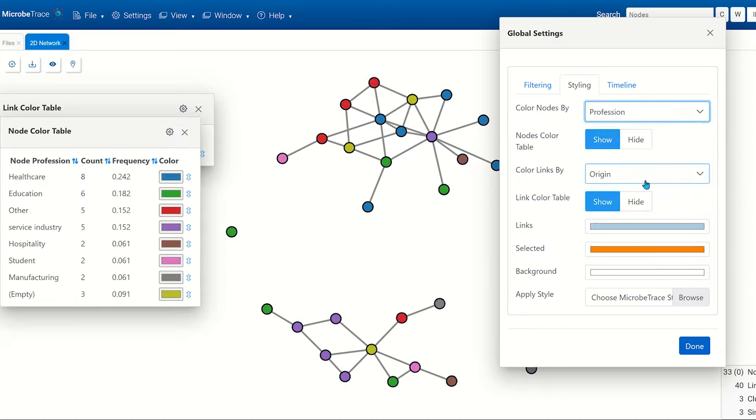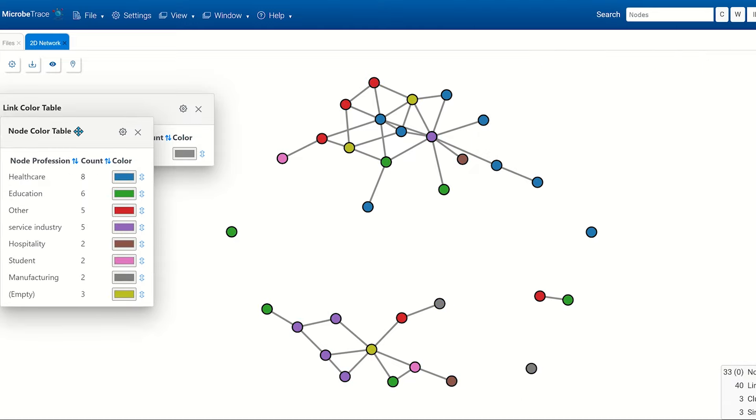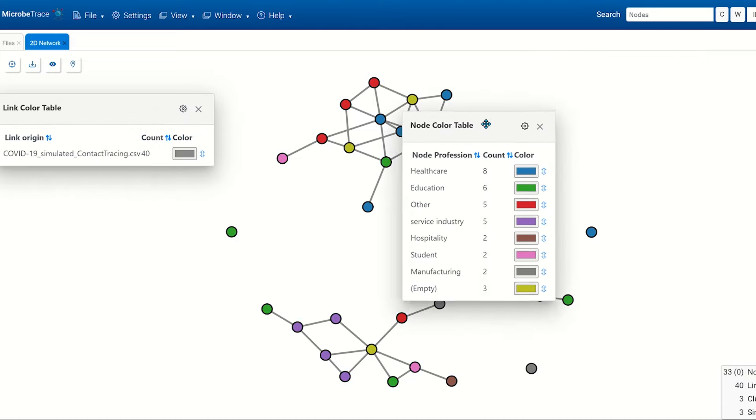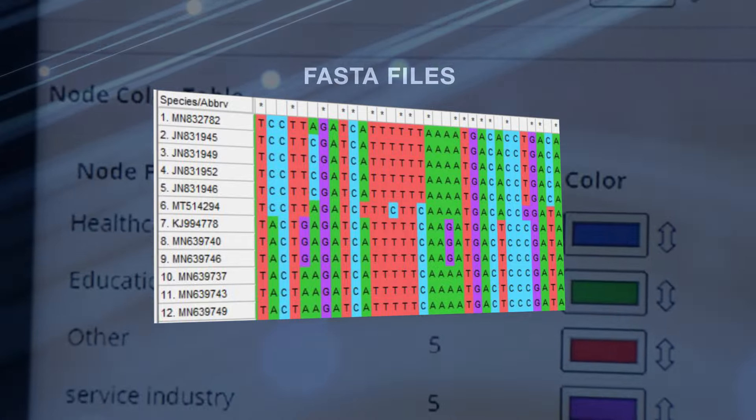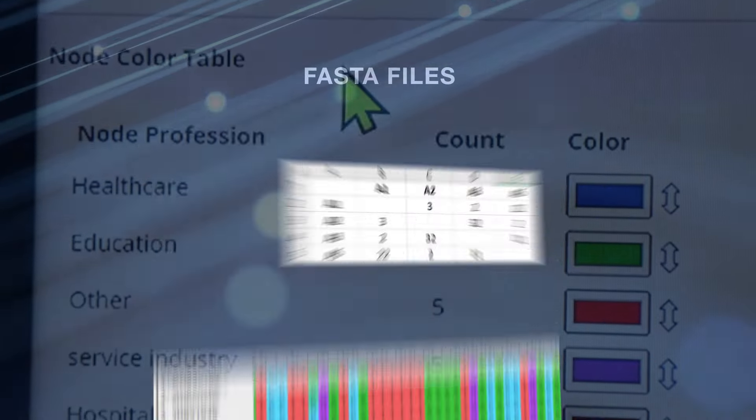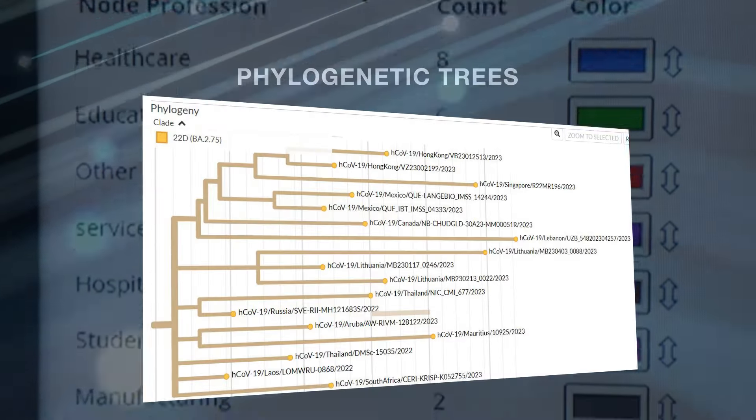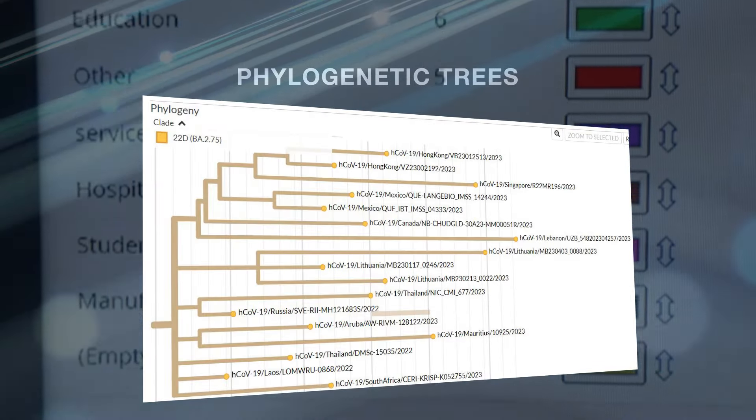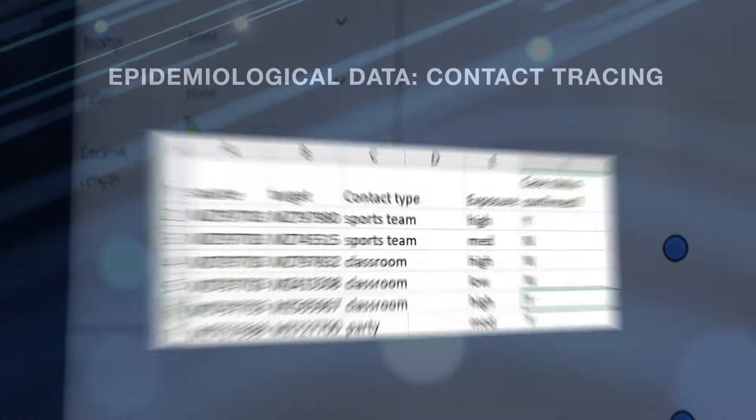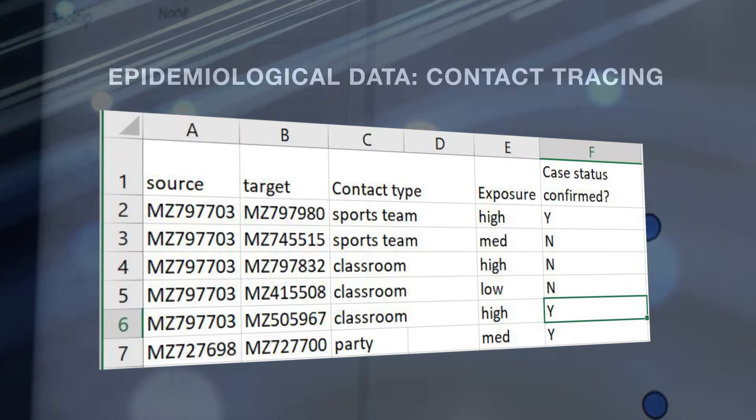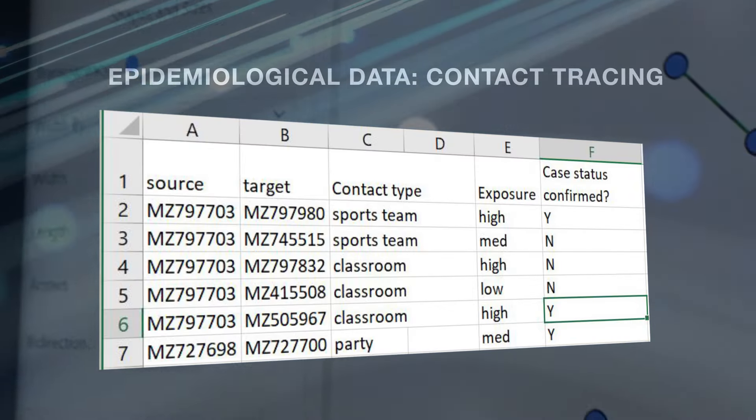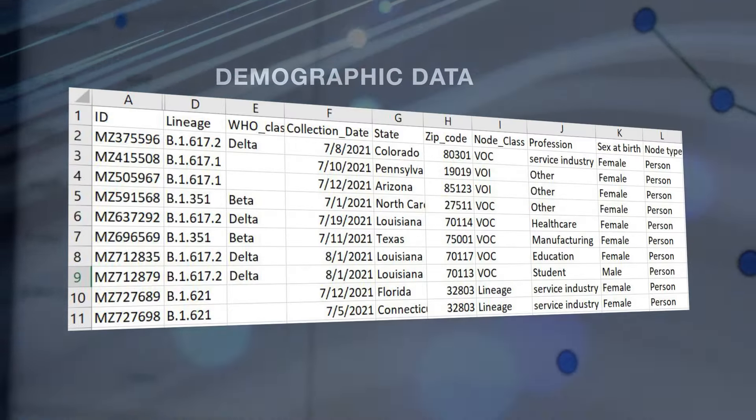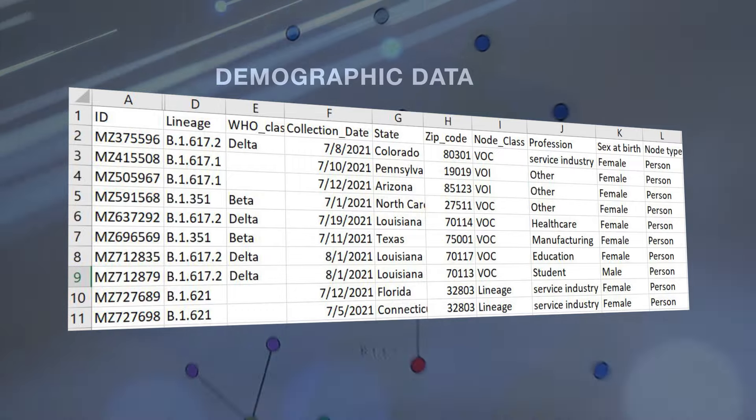Any combination of input files can be used: molecular data like FASTA files, distance matrices, or phylogenetic trees; epidemiological data like contact tracing lists; and demographic data about the nodes.